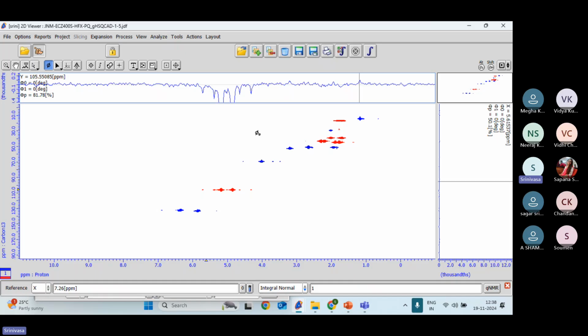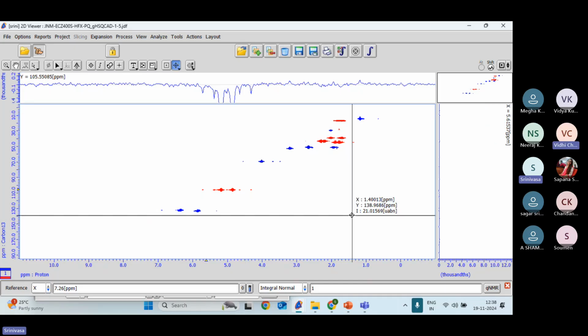Okay. So done. Now phase correction is done here. Similar things you have to do for the column vertical also. How to do vertical? Go to the selection of these slides. Go to the last option in the context menu bar, like here, this one. Click and take one from the right side.